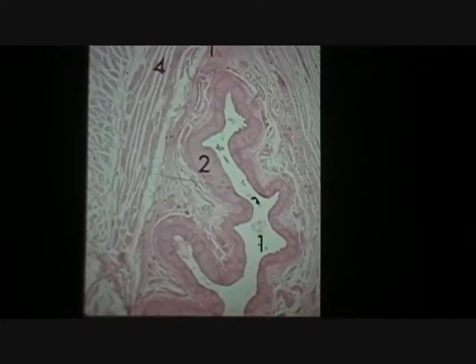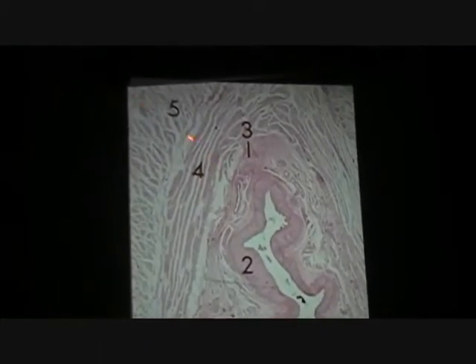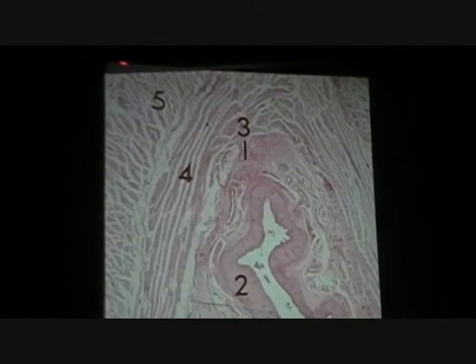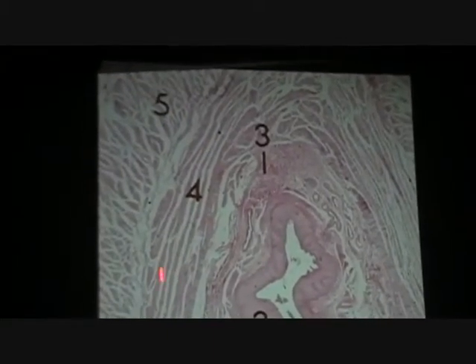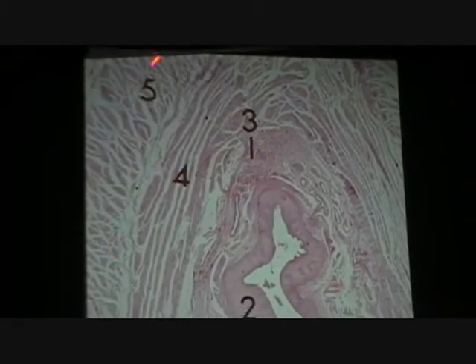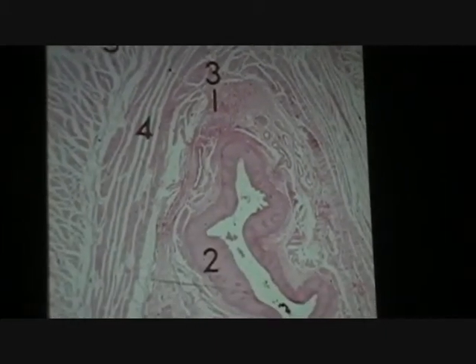What do we tease out over here? Yeah, that's the muscularis externa showing the different grain. The grains here where this is circular and this is longitudinal. That's really what it was done for.